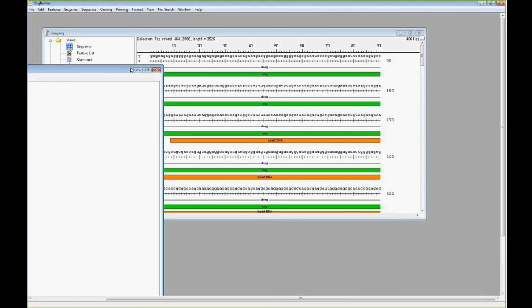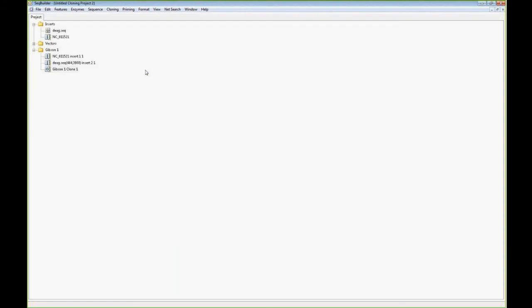Actually, Brian, can I interrupt you just for a moment? Sure. I have a couple of questions that have come in about the Gibson cloning workflow. The first question is, you made a selection when you were linearizing that. Can you also use restriction enzymes? How would you go about making a selection based on restriction enzymes instead of just dragging your mouse across?